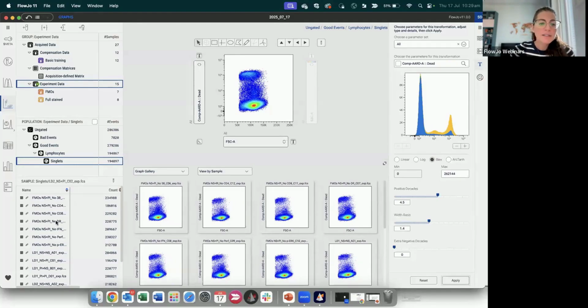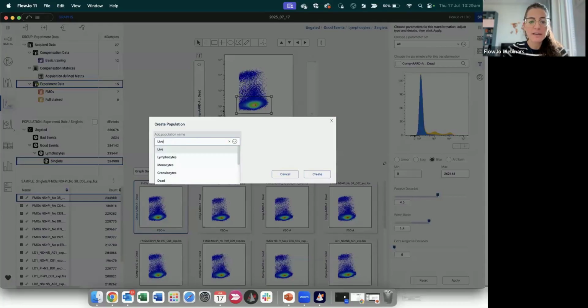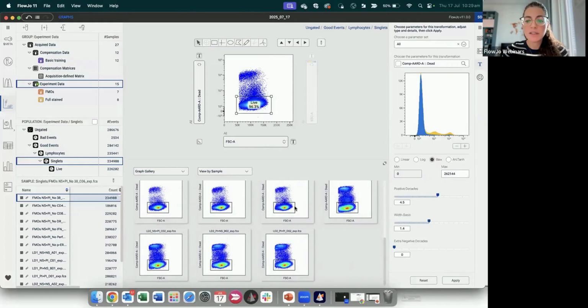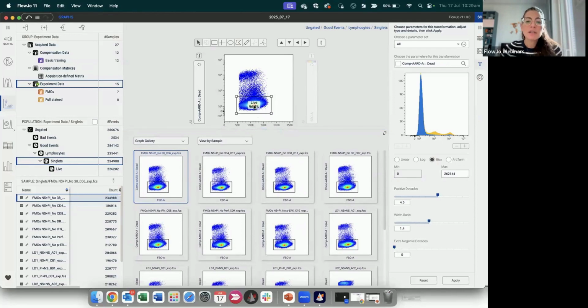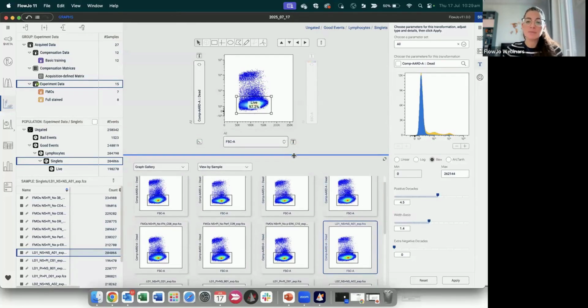At this point, I can scroll down, look at individual samples on that. I can choose one sample to gate on. Again, I will choose, for example, my rectangle gate in this case, and I will have my live cells. And now my gate has been created on all my cells. What's the advantage here? Is that I can look at my events or at my samples individually, like I'm doing in this case. I can either scroll down each individual sample and look at it, or I can look at all my samples at the same time.